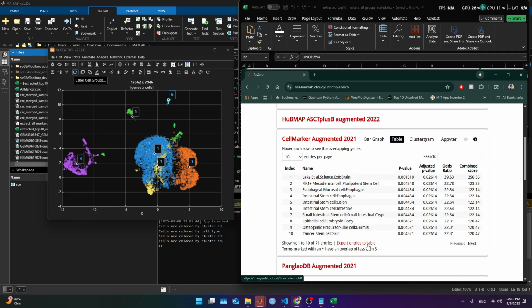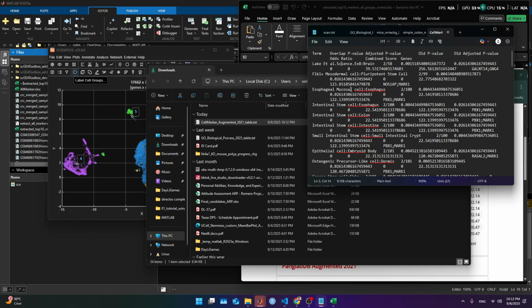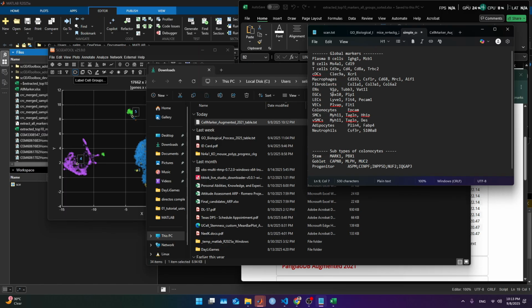We're gonna download that again and build the markers in this case. We've got to look for intestinal stem cell, and the 2 markers we found are these 2. We start building our marker set. Here, I'm gonna put it here. Oh, those are here already. Great, that's it, stem cell. We have goblet cell, and we have to bring fibroblast here, and macrophages, this one.